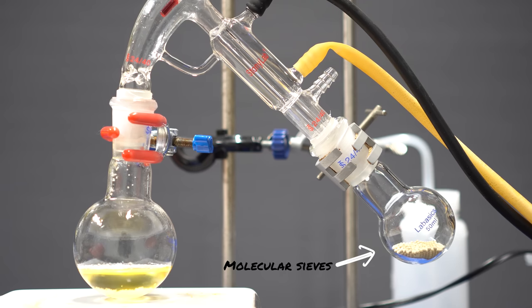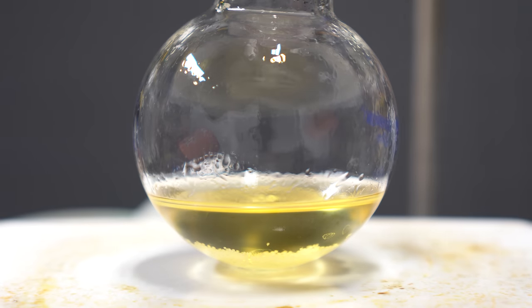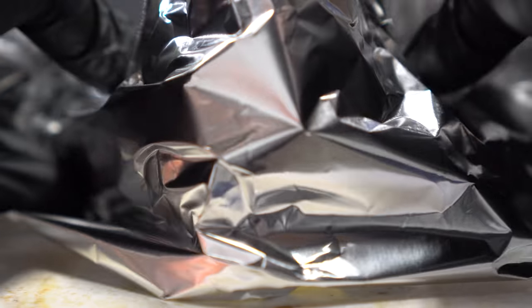I then set up for a simple distillation, with some molecular sieves in the receiving flask. This way, I could just dry everything as it comes over, and it would just make my life a lot easier. Again, I wrapped everything in aluminum foil, and I waited for it to boil.